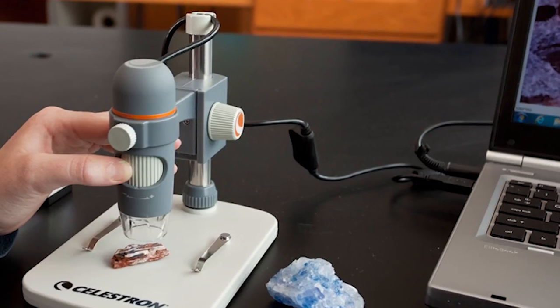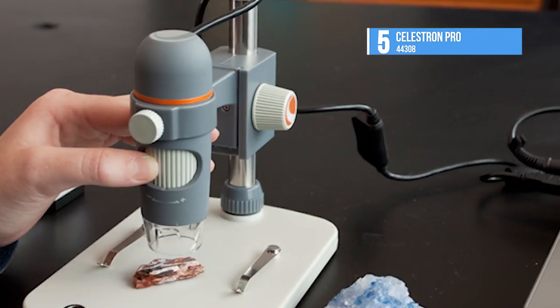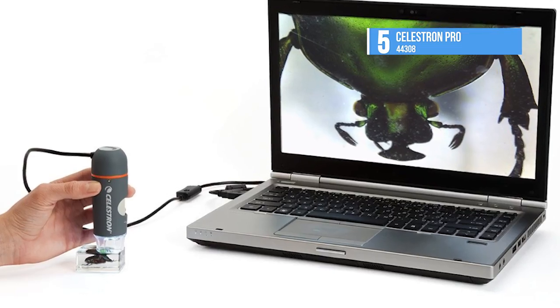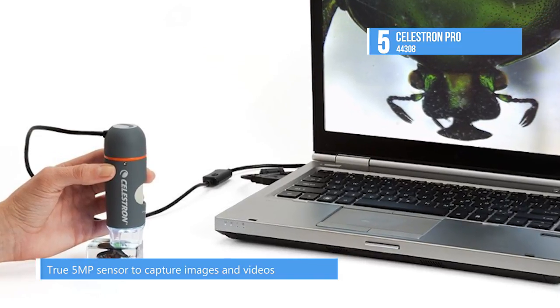We have the Celestron Pro 44308 as the fifth best product on our list. Enhance your workbench or lab with Celestron's handheld digital microscope Pro. This compact magnifying tool offers handheld and stand-mounted operating options.